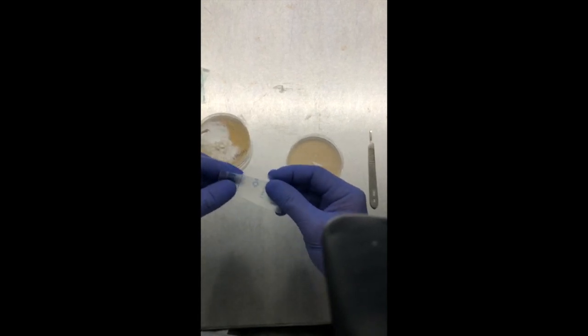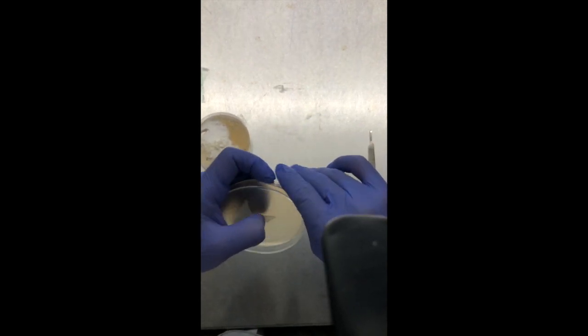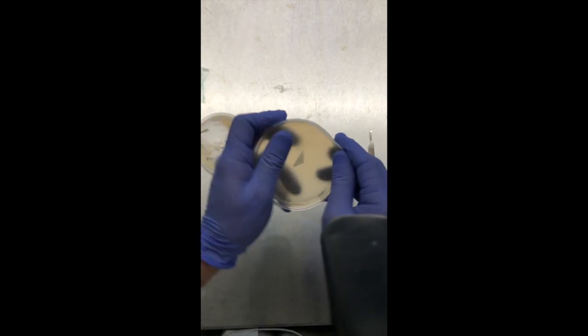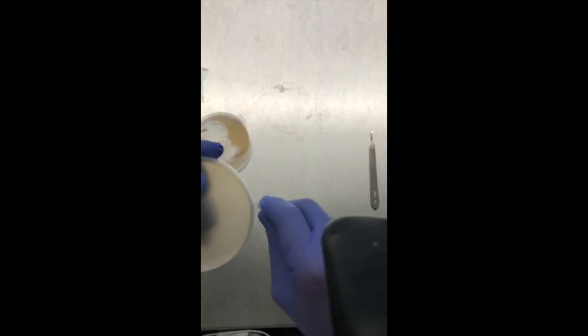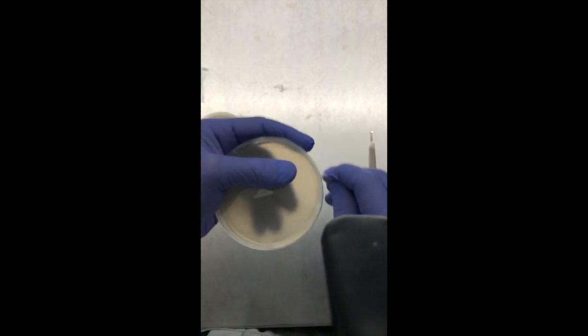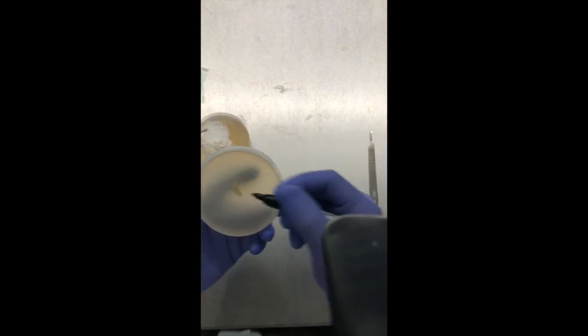The next step is to take some parafilm and seal up this plate for storage. I like to do a couple layers of this. The parafilm is a little older so it's breaking on me, but there you have it. Now I'm going to label this as a transfer to plate.